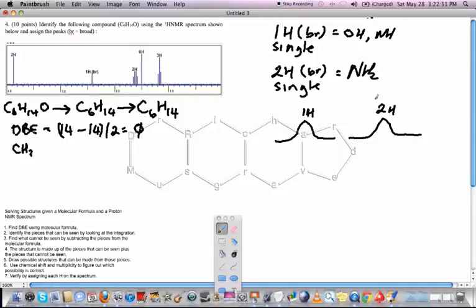The broadness varies, but since I can't show this on this spectrum, since these are straight lines, I always write BR to see if this would be broad or not. And this can help us to see whether it's an OH or an NH or an NH2, rather than a CH or a CH2 or a CH3.